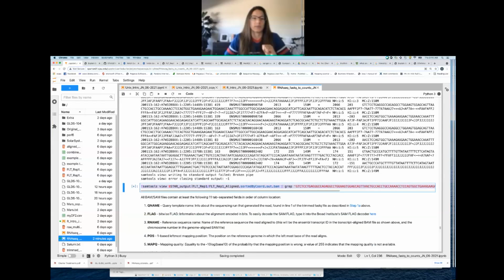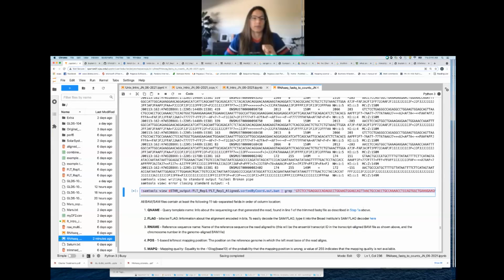Another thing we could do, which I probably should have done first because it would have been faster, but it wouldn't have given us as much information, is take a look at your GTF file. So that annotation file that you provided STAR to build the reference, and you can grep for one of these transcripts and see what gene it's associated with. I'm not going to have you guys run that right now, just because we're all currently running this grep function here.